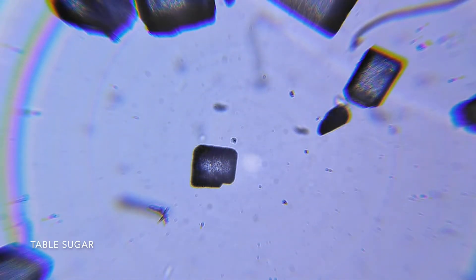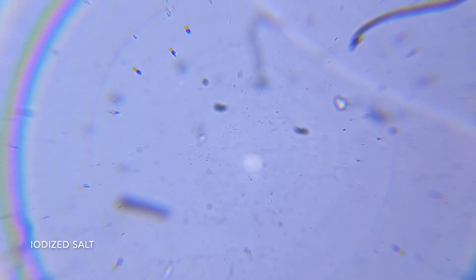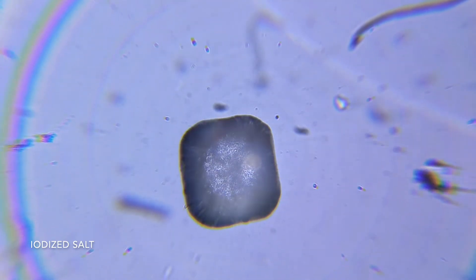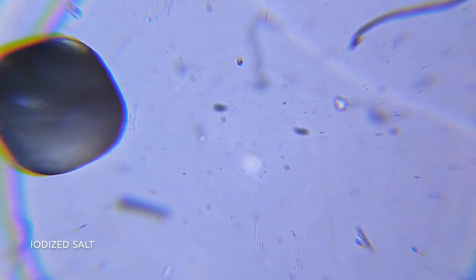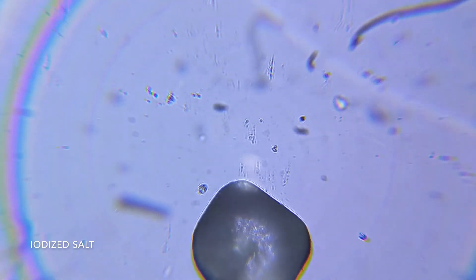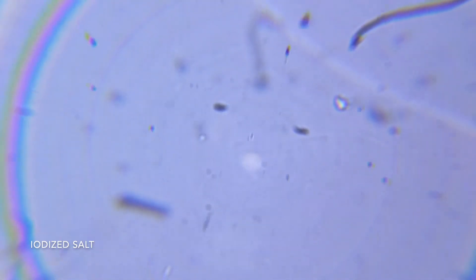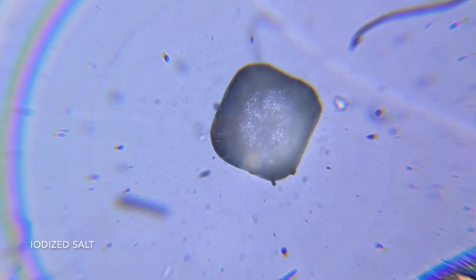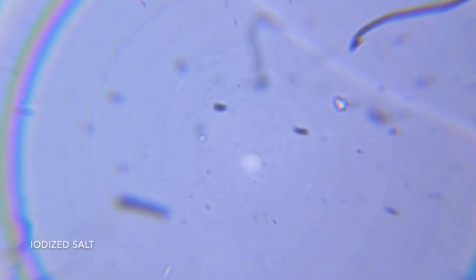Now let's look at the salt. So this is the salt right here. Wow, they're a lot bigger. Wow, it's almost like a square.